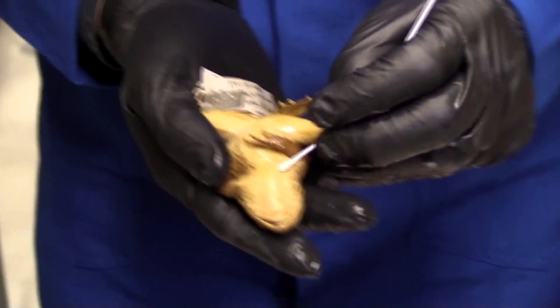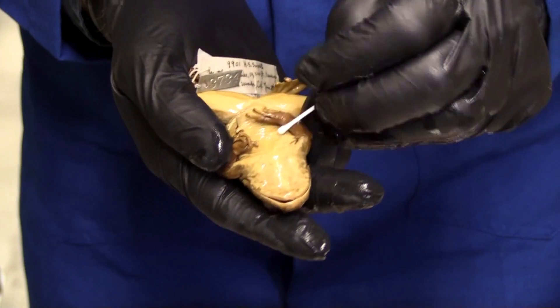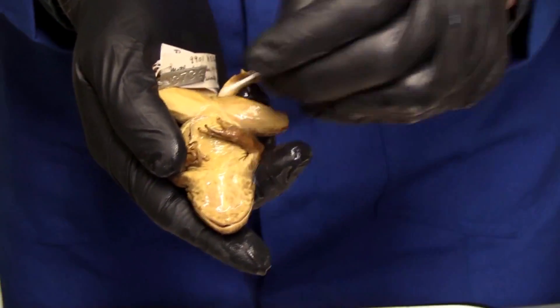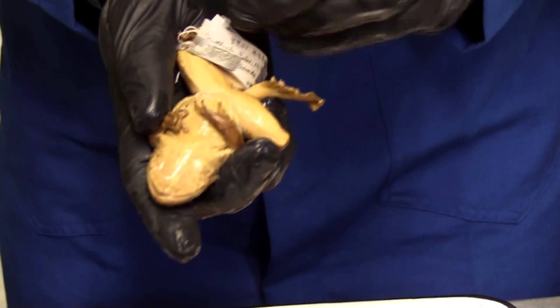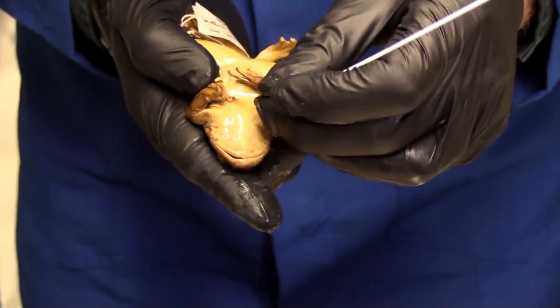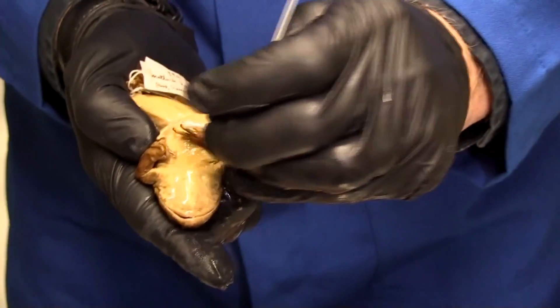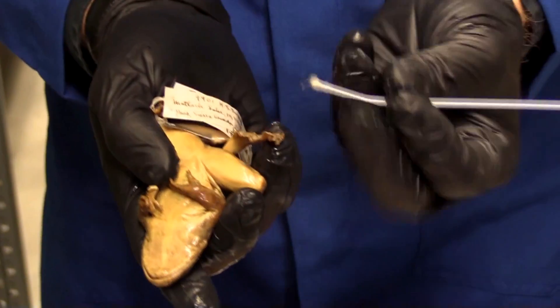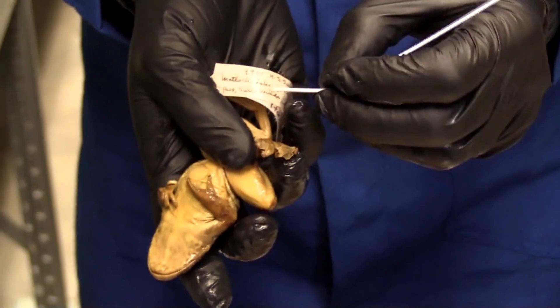Notice I'm bending the swab a little bit and twirling it. These are techniques that allow me to know that I'm getting enough friction and covering enough surface area to collect skin tissue. It's okay to continually rub across the whole animal, but these areas are the most likely places where we're going to find the infection.